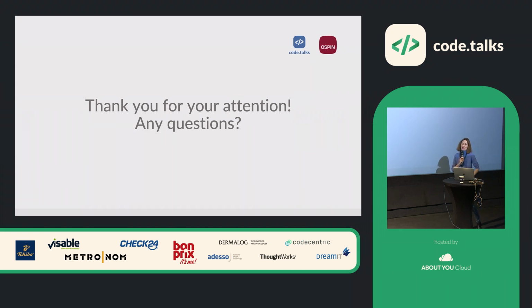So one of the things that we are planning and have to do is to put in some sanity checks. With the example I was showing with the glucose and the pump, of course you could start doing crazy stuff and connecting a pump with, I don't know, a heater or whatever. It doesn't make any sense. So of course you have to do some checks there and make sure that what the user is trying to do is at least not dangerous or whatever. You have to find the boundaries between what you want to allow and what you don't want to. Yeah, that's true.